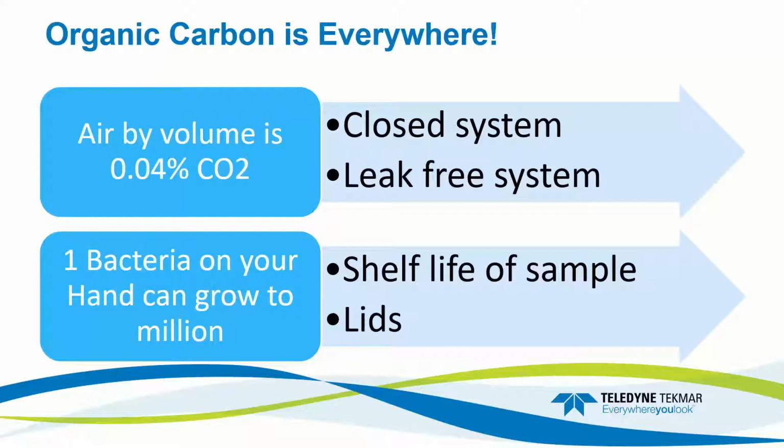Then there's the shelf life of the sample. How long do samples live in the vials? Can they be contaminated from outside sources? How do we set our lids? Do we set our lids with the cap up, or with the inside up, or down, so it doesn't pick up TOC, carbon? Knowing where carbon is in the laboratory is important.